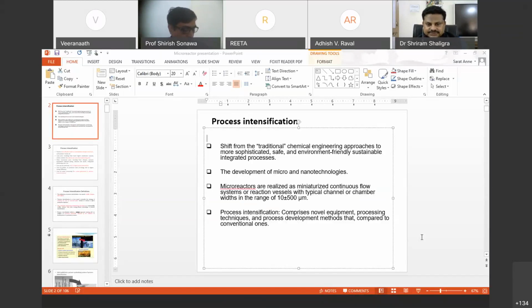for various applications, right? So if anybody has a query, one query is there: why does hydrodynamic size increase after sonication? That is because of local heating, basically. Local heating produces aggregation of the nanoparticles. Basically, as you give more time for the reaction, if the mixing time is more than the reaction time, then your reaction time is more.